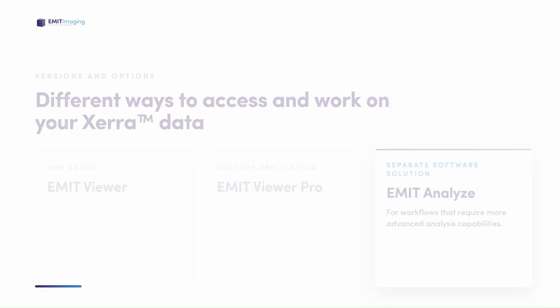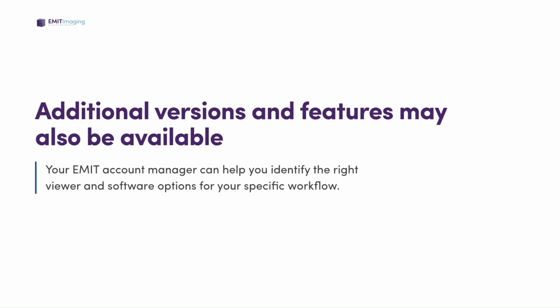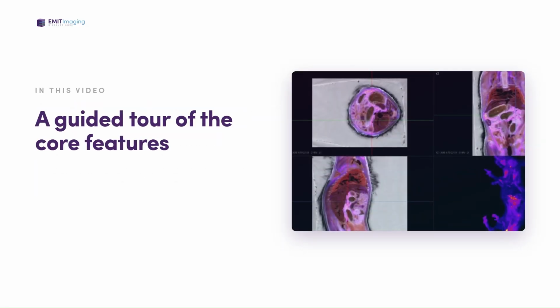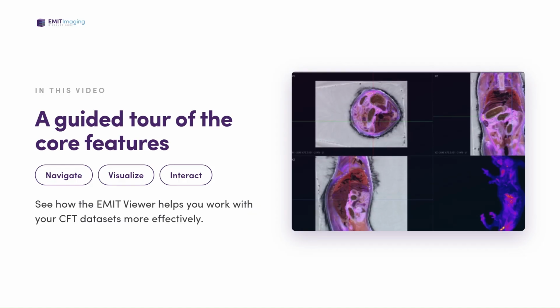Depending on your research needs, additional versions and features may also be available. Your EMIT account manager can help you identify the right viewer and software options for your specific workflow. In this video, we'll take a guided tour of the EMIT Viewer's core features and show you how they can help you navigate, visualize, and interact with your CFT datasets more effectively.